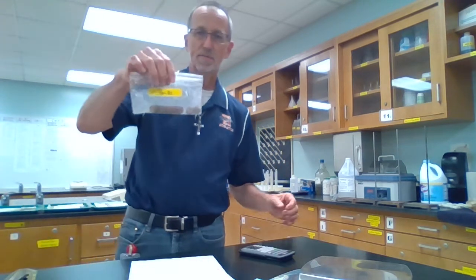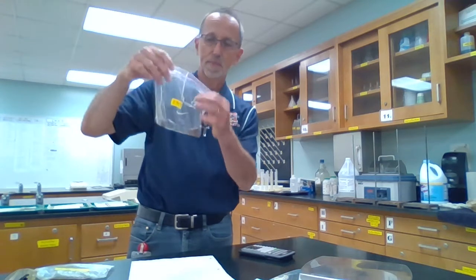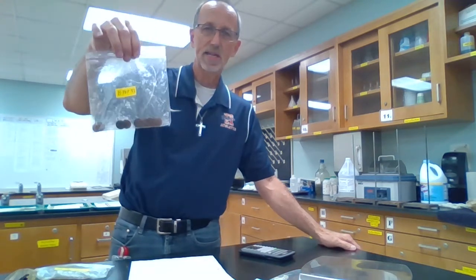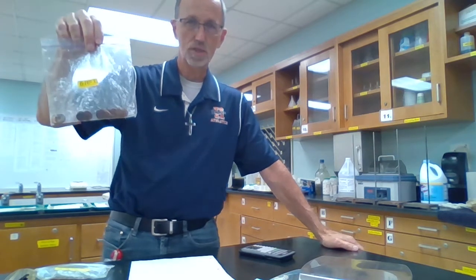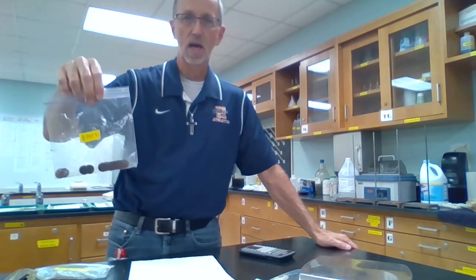So what we have, if you look at the data table with me, we're going to find the mass and volume of different numbers of pennies, both pre-82 and post-82. So we have a set of pennies here that were minted before 1982. These, of course, were pure copper. And then we have a set of pennies, set B, which were minted after 1982, which are, again, mostly zinc, with just a thin copper coating on the outside, so they look the same.